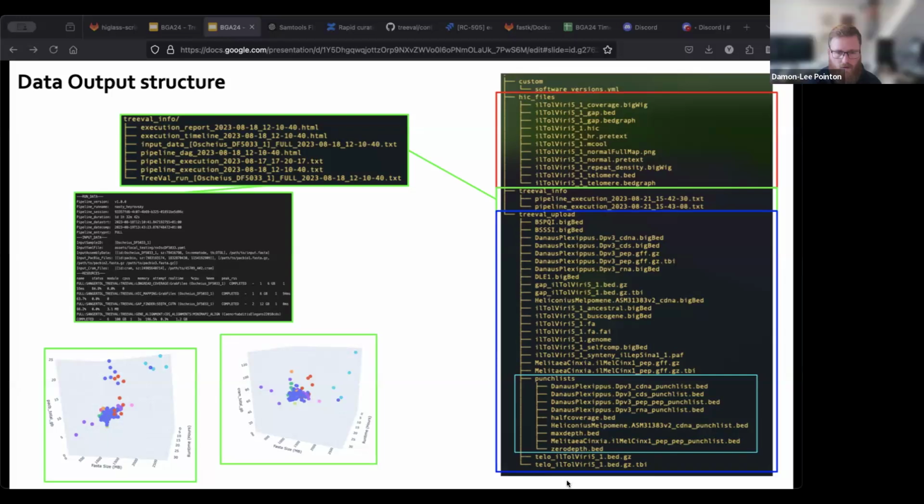Cool. Thank you. Then there's one from Terry. Long read assemblers output two pseudo haplotypes. Can you comment on how this is handled with TreeVal, please? Do you run both separately, or is there an option to run both together? I've seen both pseudo haplotypes curated together in PretextView.